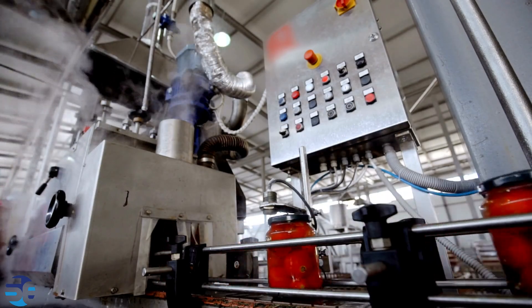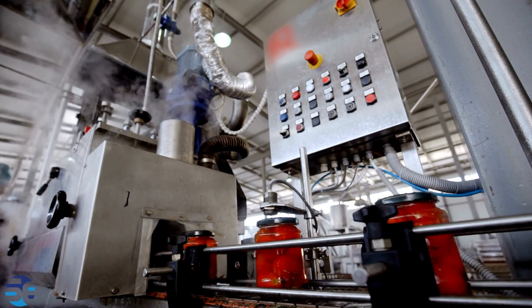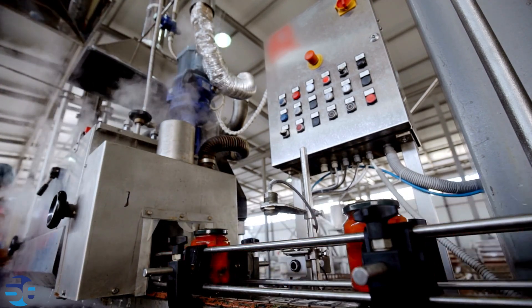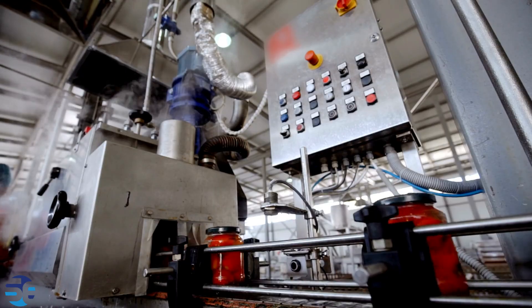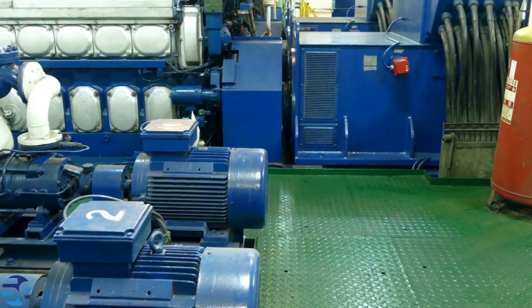In food processing applications, autoclave reactors in the food industry are used for high-pressure cooking and sterilization processes. This ensures the elimination of microorganisms and extends the shelf life of certain food products.